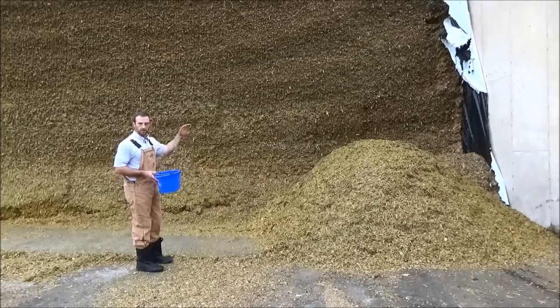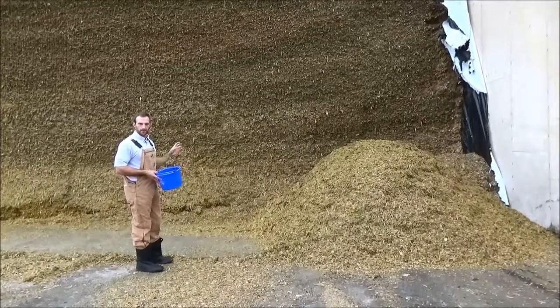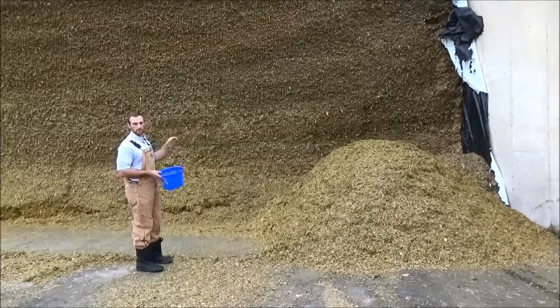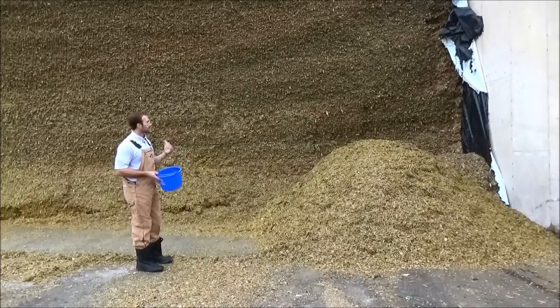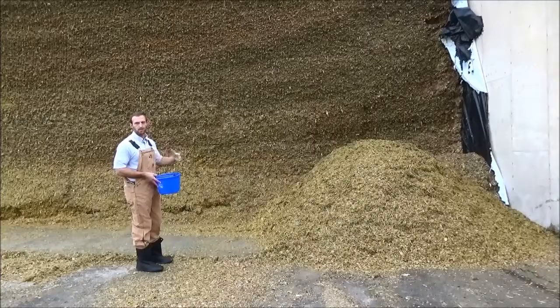That's the ideal way to prepare forage or feed prior to going into the TMR. We want to do blending — turning feed over with a simple dumping action — as it's the best way to get that forage ready for the day's feeding, because there's quite a bit of variability from left to right and from top to bottom across these bunkers. It can vary as much as six to ten percent even within the bunker due to the field, environment, genetics, and different crops potentially being blended together. So we want to try to capture all of that.